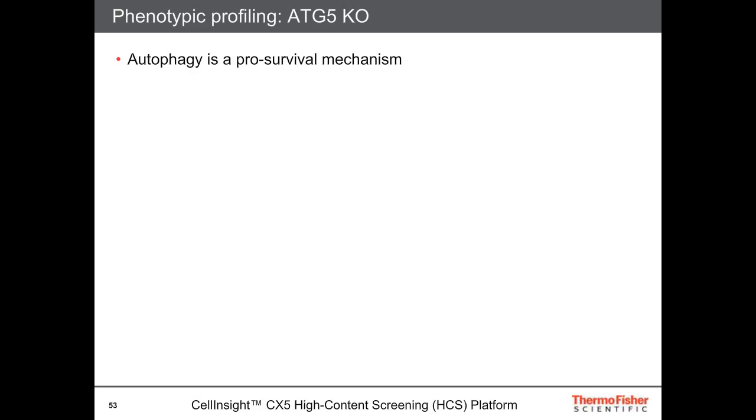So because autophagy is primarily a pro-survival mechanism, it helps cells to withstand periods of nutrient deprivation, it clears damaged organelles, as well as helping to deal with invading microorganisms, so-called xenophagy. We wondered how healthy these cells were. During our cell culture, we'll assess viability with our cell counter, and we actually noticed there was no difference in viability. So maybe the cells were still alive, but perhaps they were teetering on the edge and were ready to die at the slightest stress.